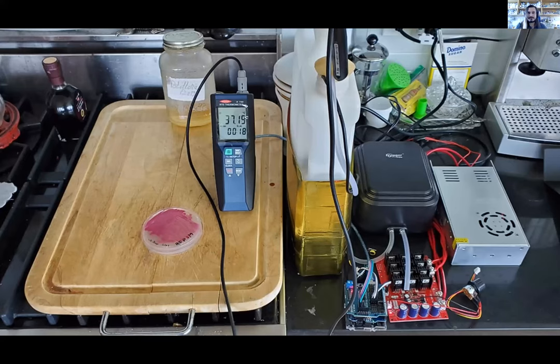And so I turned on the device, and after very little nitpicking, in less than an hour, it actually stabilized at 37.2 degrees Celsius, right? Like on the money. So this is a platinum electrode. It's my most expensive thermometer. It's the reference for my lab. It's what I use to calibrate my PCR machines with, right? So I paid way too much money for this thermometer because I needed a standard. And so I standardized my bioreactor based off of this. And I started logging the temperatures, and I let it go overnight just to make sure that the house won't catch fire, because again, 60 amps is a decent amount of power.